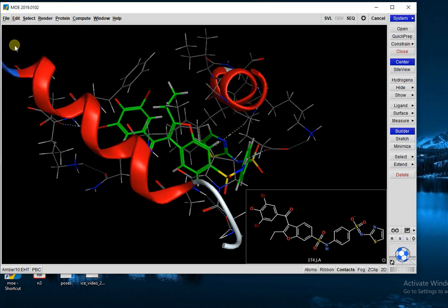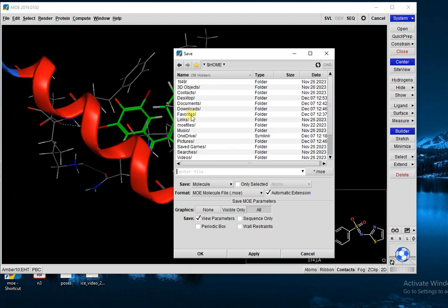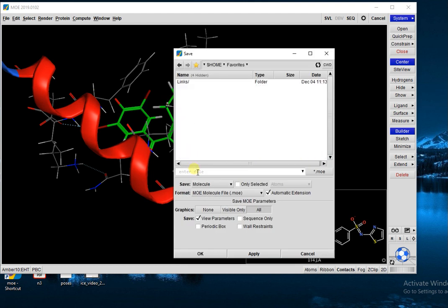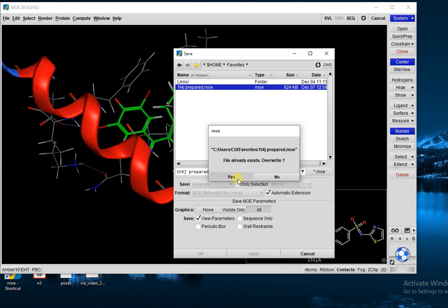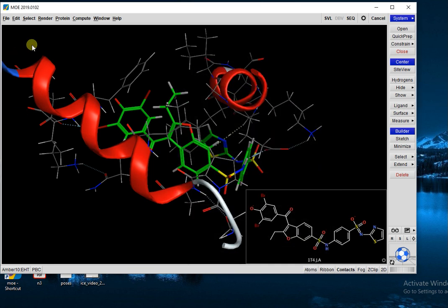I give it a name. My enzyme name is 1T4J. I just write the name. As this protein is prepared, I simply write 'prepared', then Apply. Now press OK. This protein is saved in your folder.